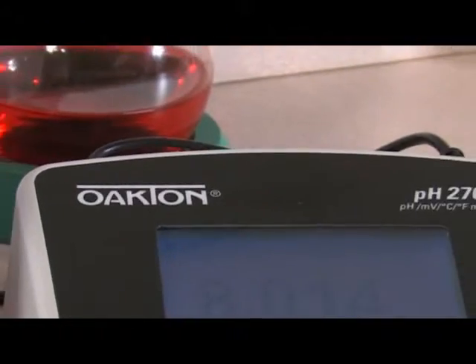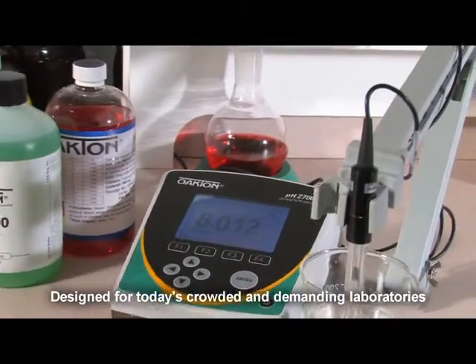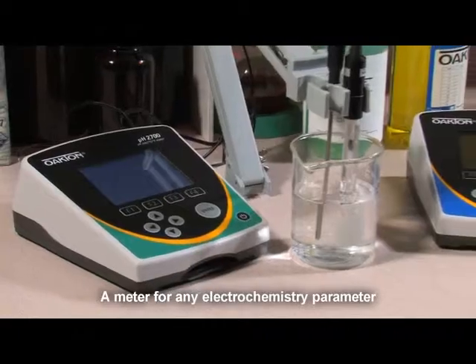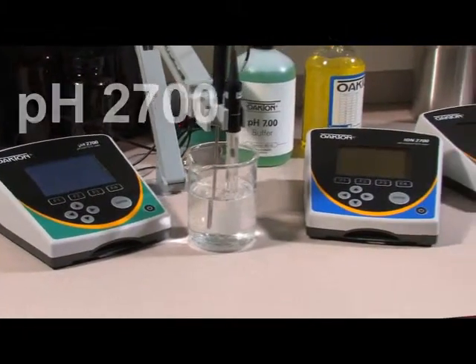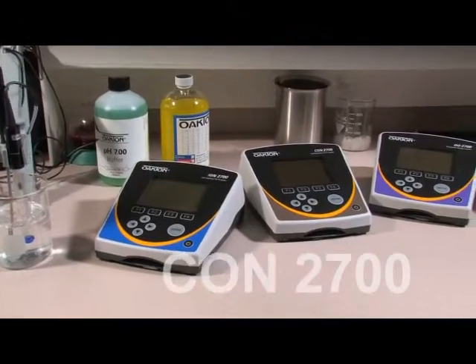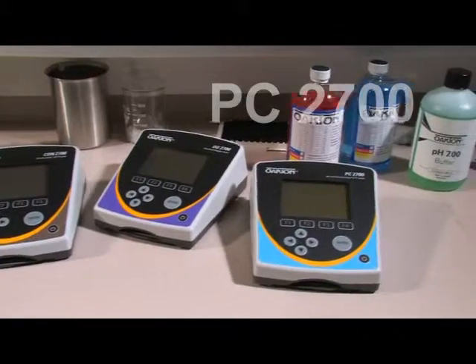Oakton Instruments proudly presents our new 2700 series of research-grade benchtop electrochemistry meters. Oakton 2700 benchtop meters measure pH, ion concentration, conductivity or total dissolved solids, dissolved oxygen, and BOD, as well as multiple parameters.